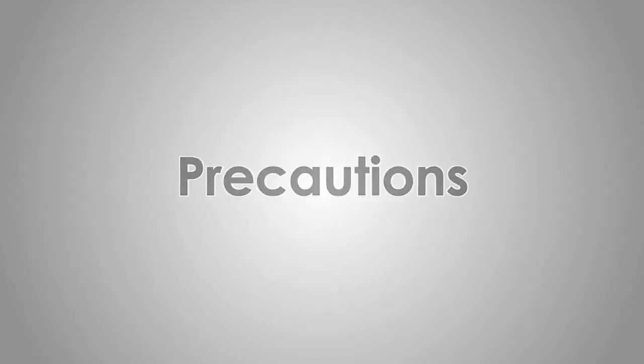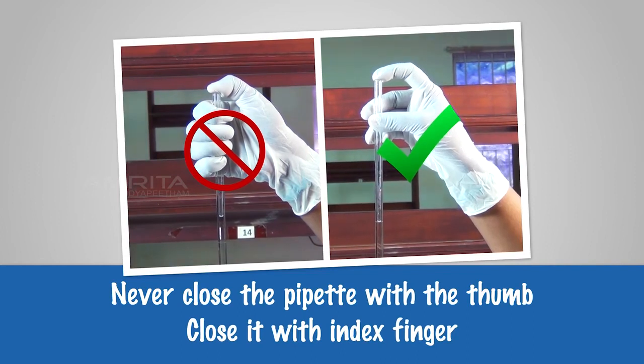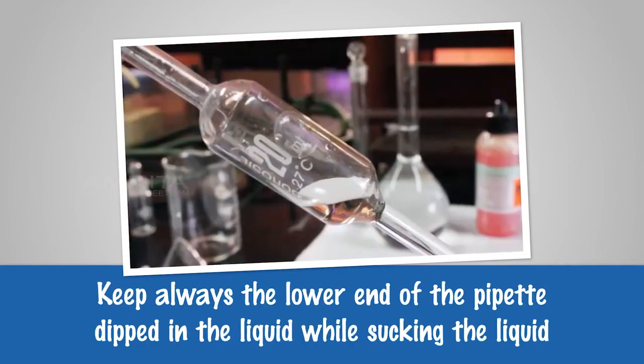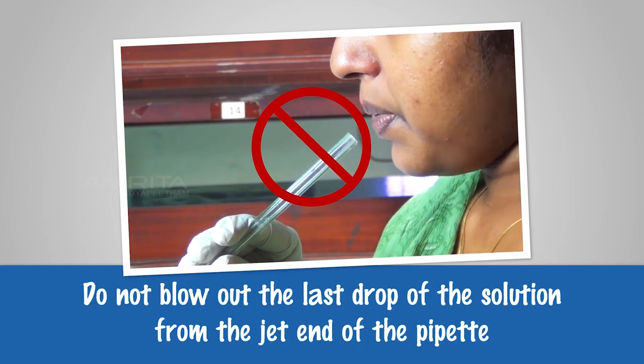Precautions. Never close the pipette with the thumb. Close it with the index finger. Always keep the lower end of the pipette dipped in the liquid while sucking the liquid. Do not blow out the last drop of the solution from the jet end of the pipette.